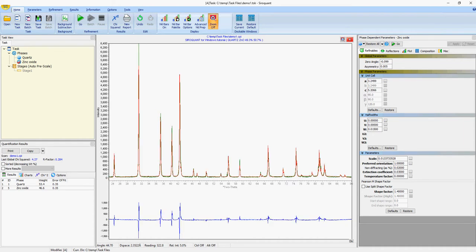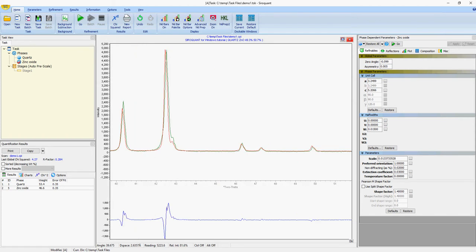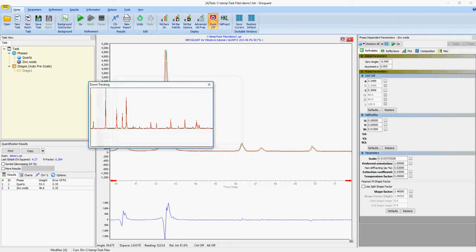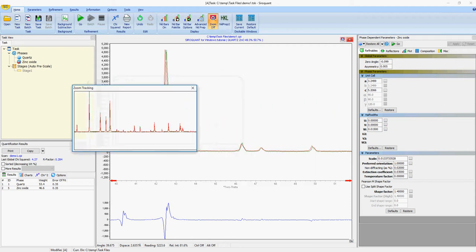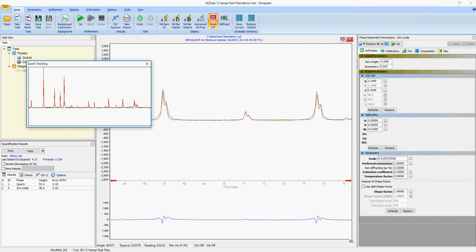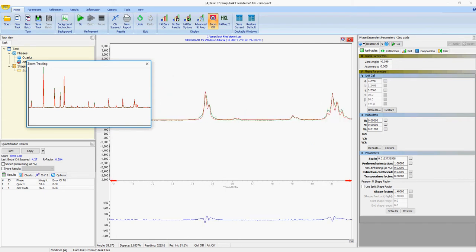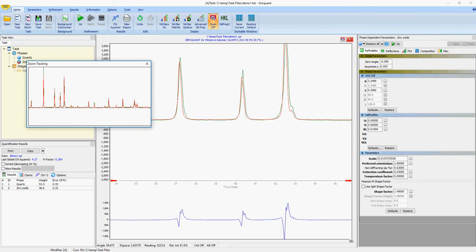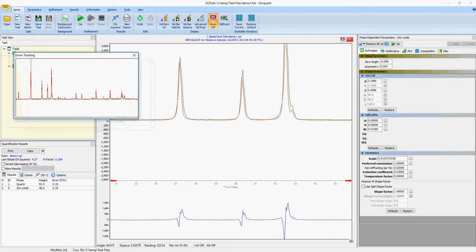SARAquant also has the option of a zoom tracker. So when you click down and to the right, you can see that the zoom tracker is enabled and this will allow you to move to different areas within the scan while still seeing the overview of the scan.